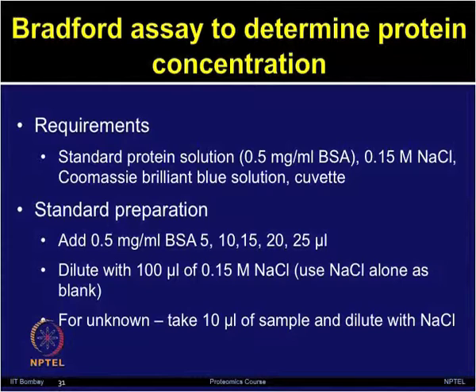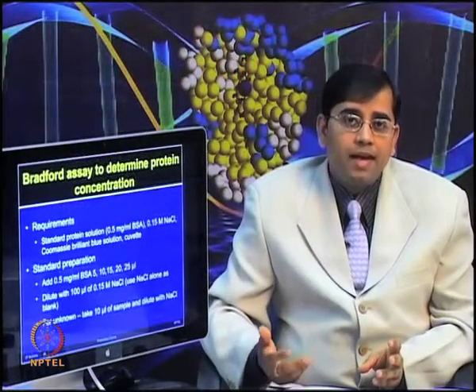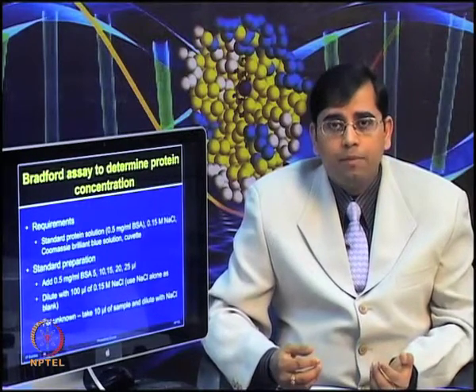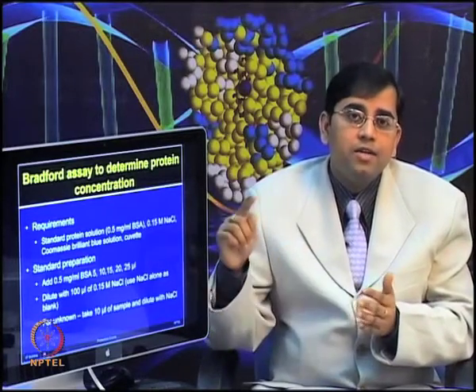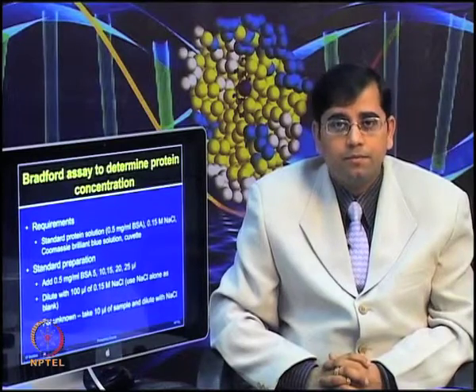Now, if your unknown is giving you absorbance higher than your standard preparation, whatever series you have made, it is a better idea to try different dilutions of your unknown sample, because it has to fall within the standard curve of the standard dilutions that you have taken.